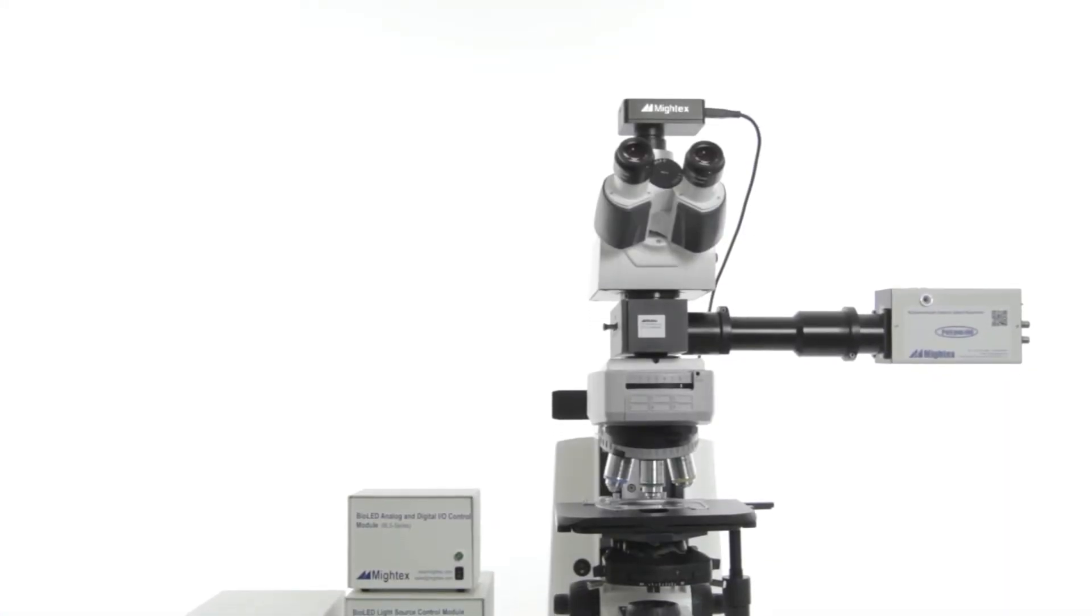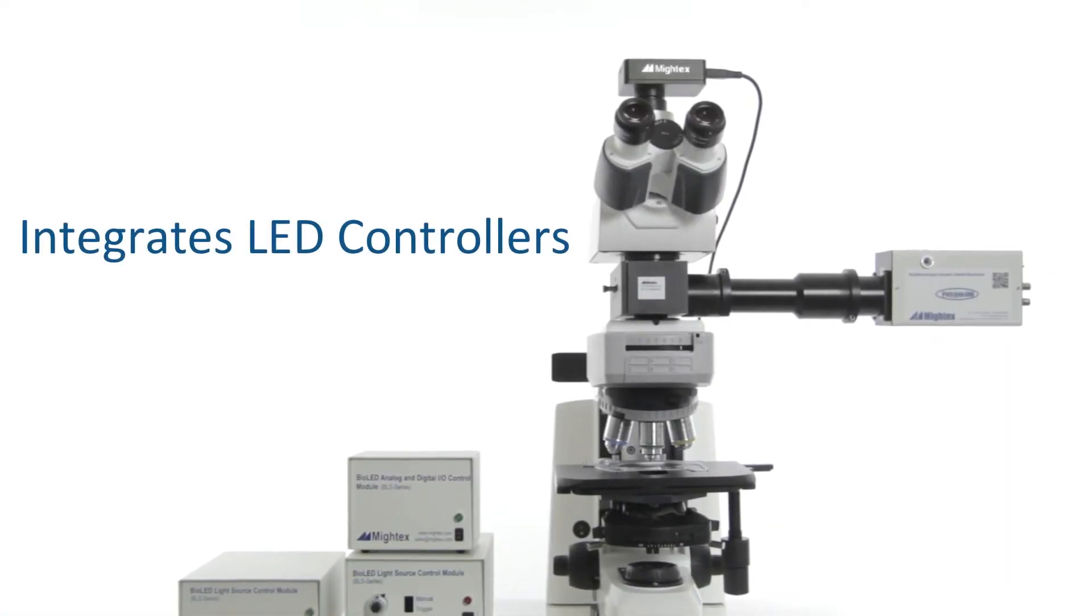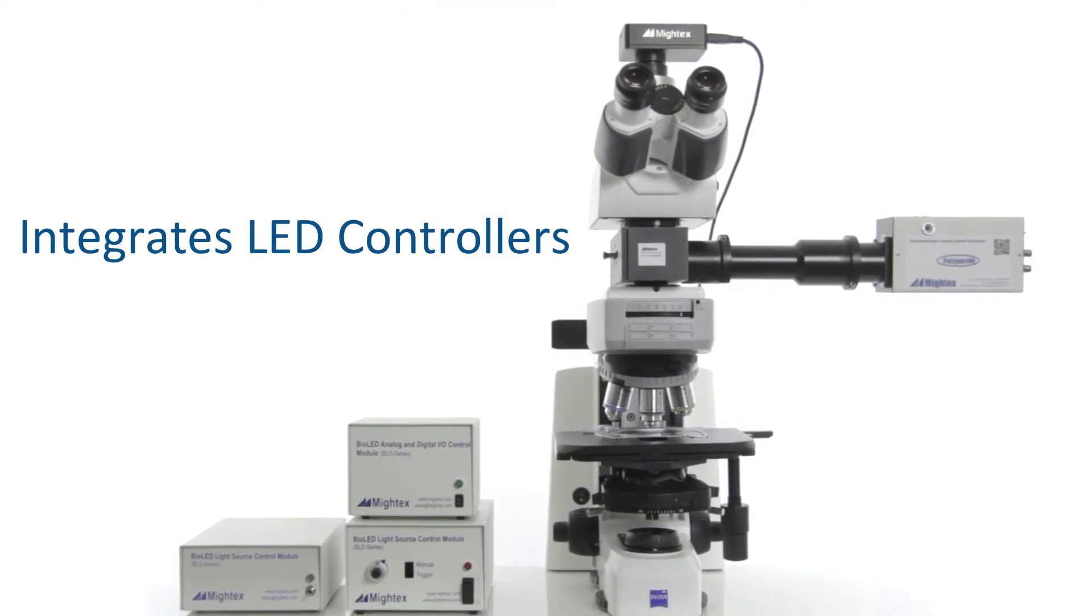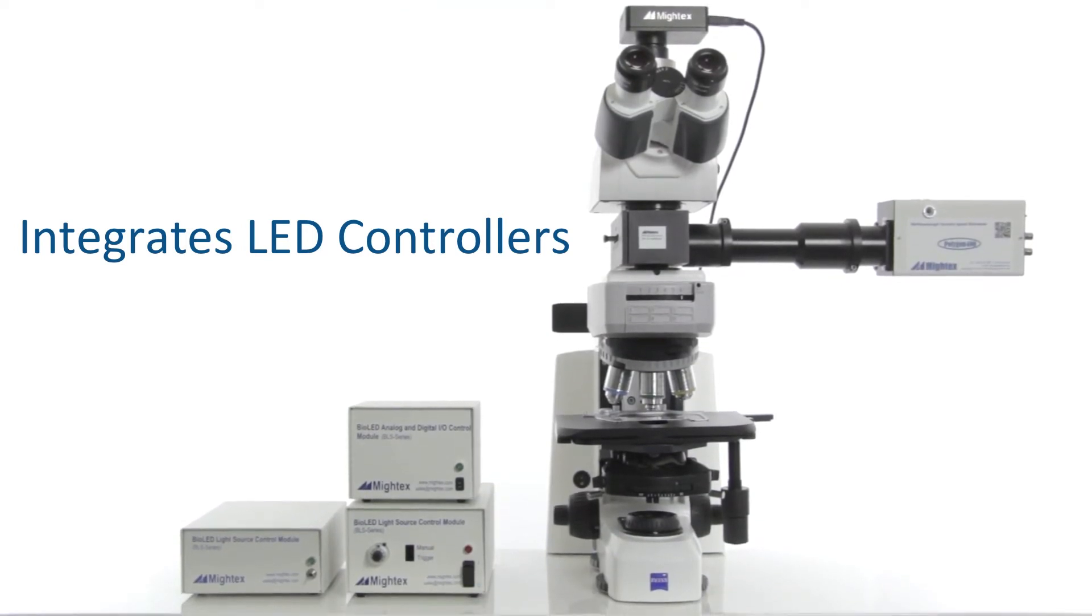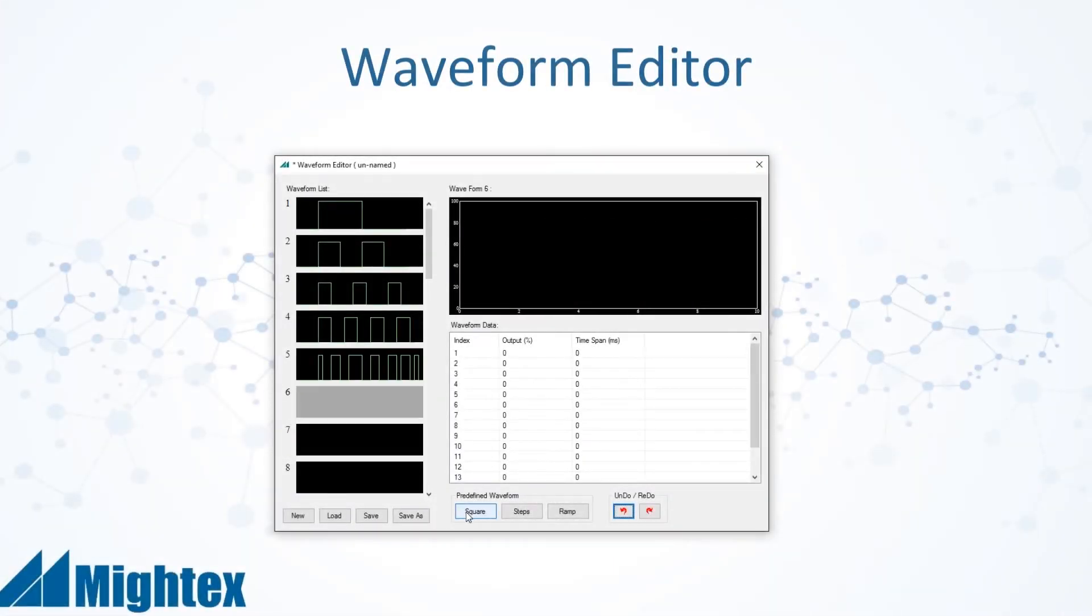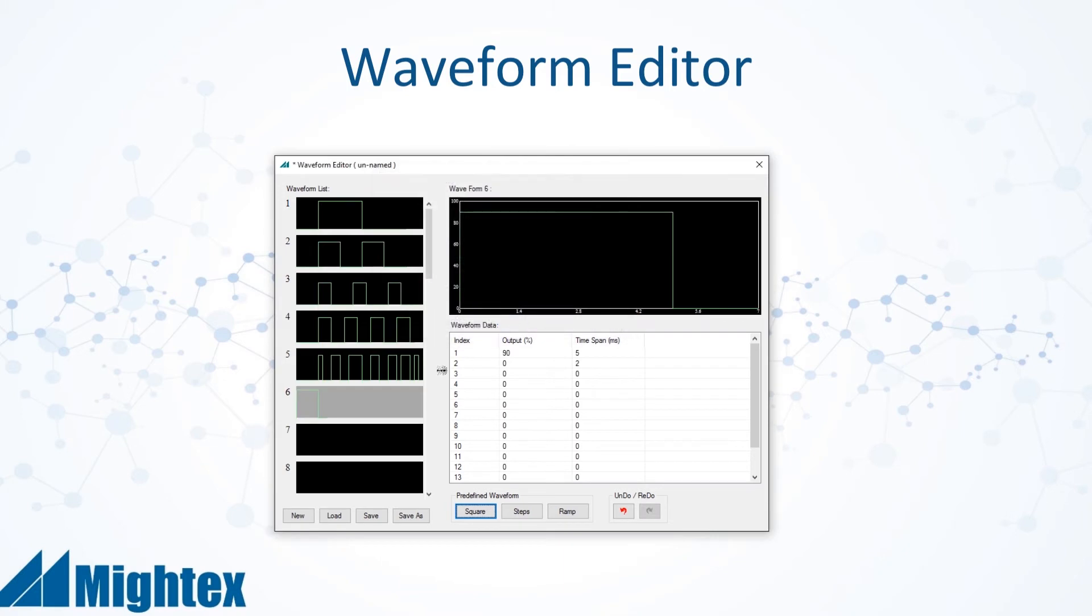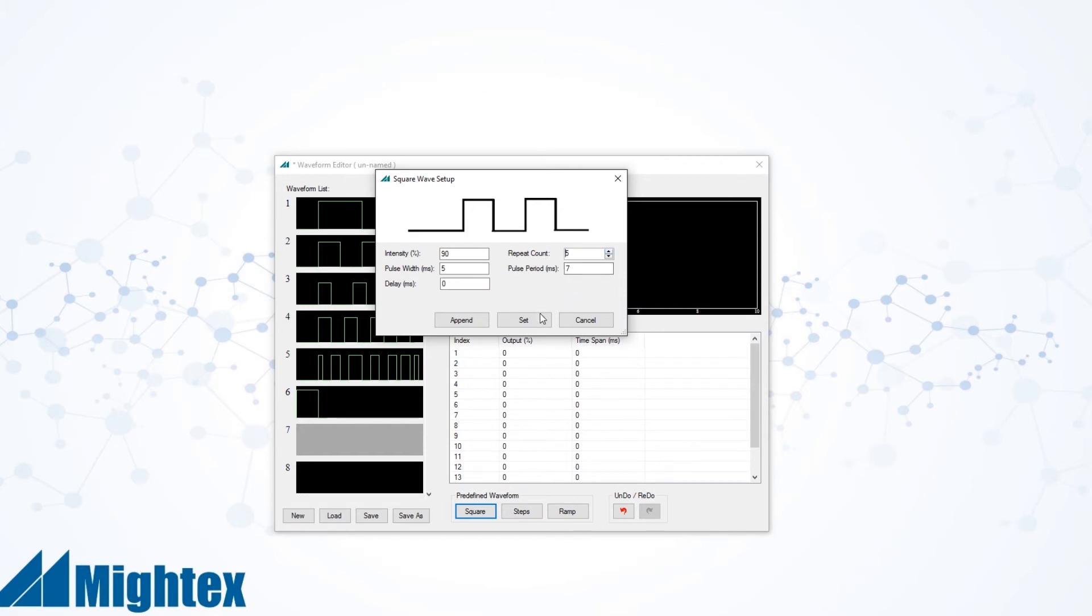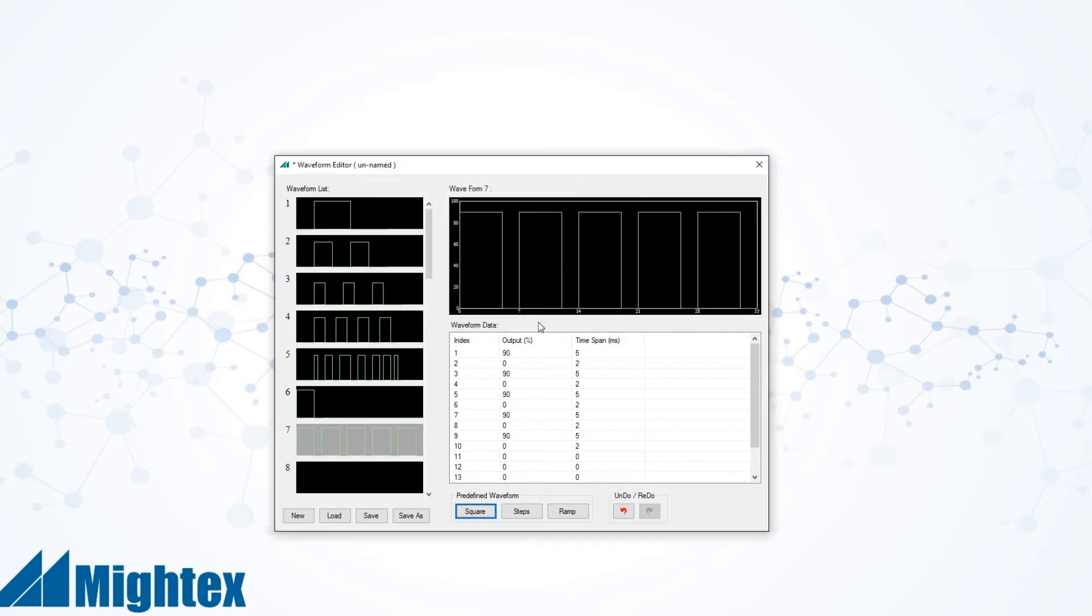New to PolyScan is the ability to operate all Mightex LED controllers, which means the temporal and intensity parameters can be defined for each illumination pattern through the waveform editor feature. A waveform is the combination of the temporal and intensity parameters. This is an important tool because many experiments require researchers to study the effects of these temporal and intensity parameters.